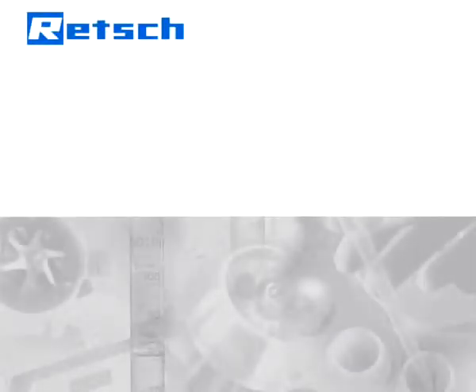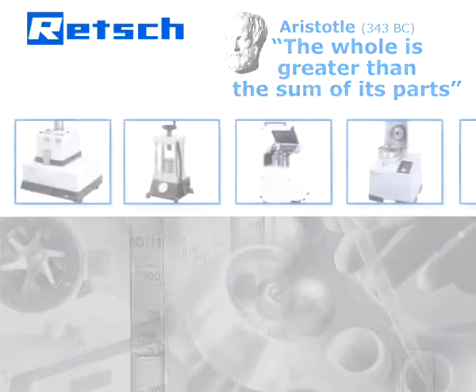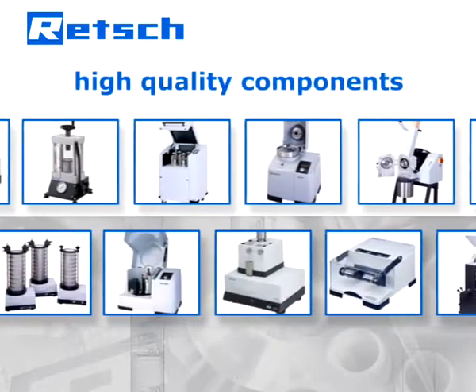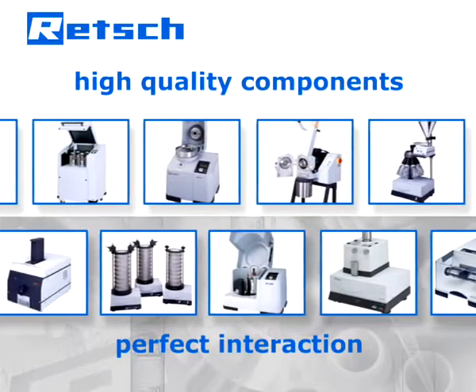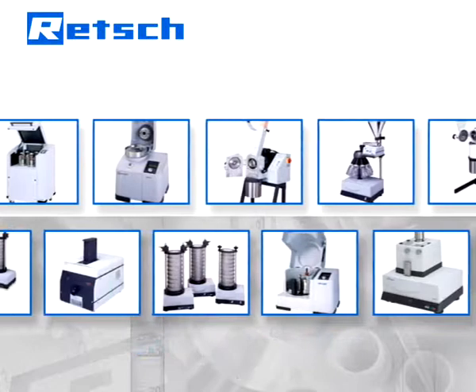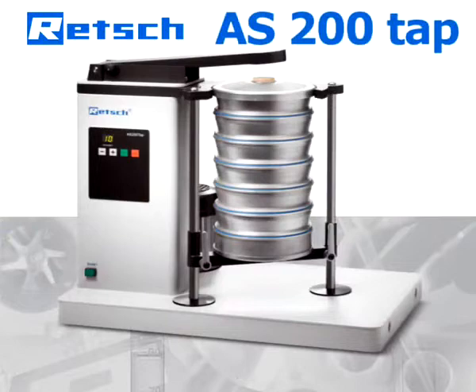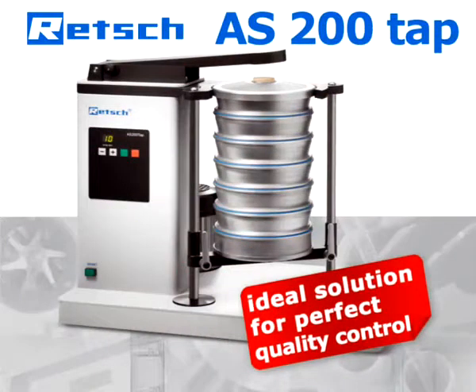Retsch's product philosophy is based on a quote by Aristotle: the whole is greater than the sum of its parts. According to this principle, we do not simply choose high-quality components, but also pay full attention to their perfect interaction. The result are instruments characterized by exceptional reliability and superior features. This approach makes the TAP sieve shaker AS200 TAP the ideal solution for perfect quality control.